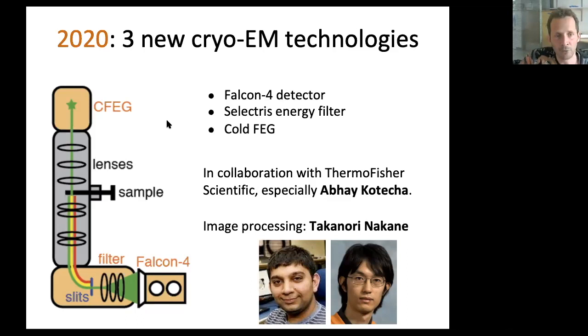So this microscope has a cold field emission gun, a stable Selectris energy filter, and the latest generation of detector called the Falcon 4. Now, Abhay collected images on some test samples, and these were processed in my group by Takanori Nakane, who's a very talented postdoc.